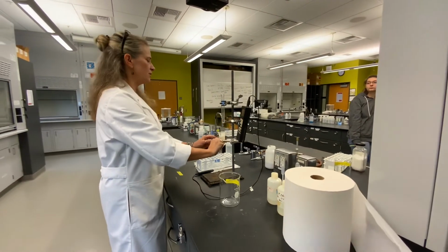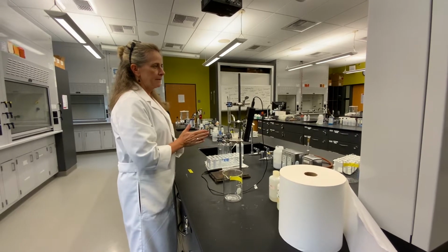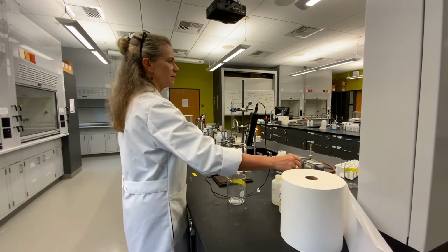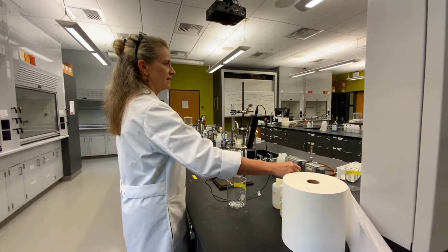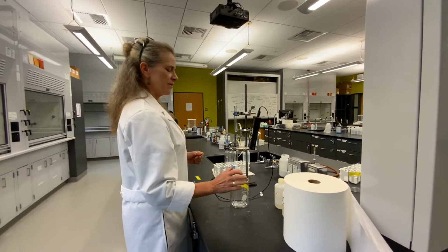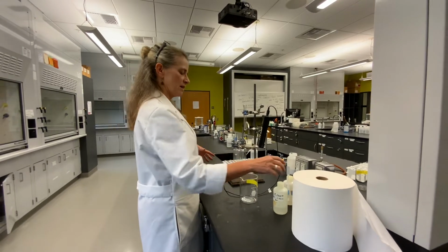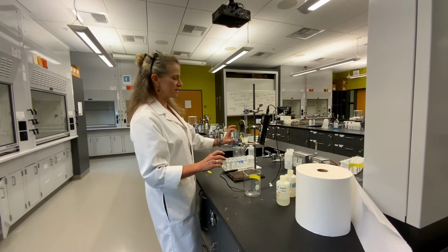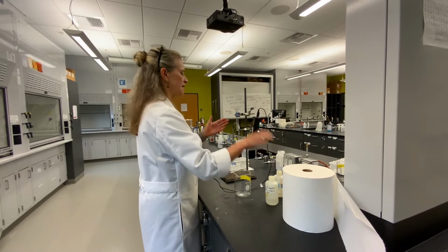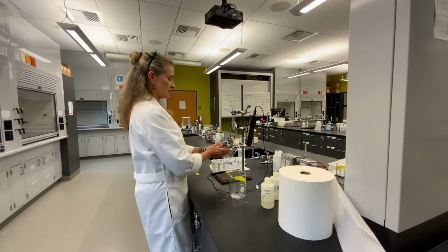Can you guys read to me the volume you're supposed to add for number 7? It's on the back, the second page. It's not 5 mils, is it? I thought it was. Is it 5 mils? Yeah. Okay, they must have not done 5 mils. So it doesn't have to be 5 mils, it could be more like 3, because the other class had it all the way to the top and then they couldn't fit the thermometer in there. So you're going to do 1 test tube of hydrochloric, 1 test tube of sodium hydroxide, okay?